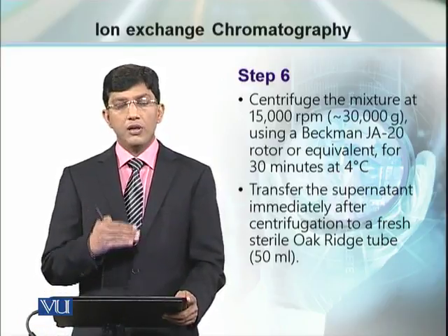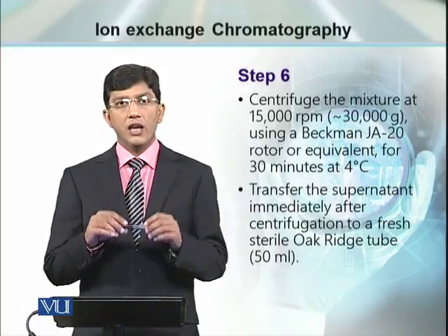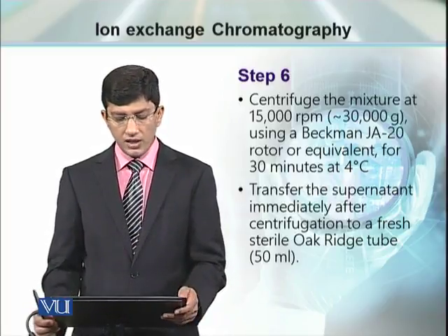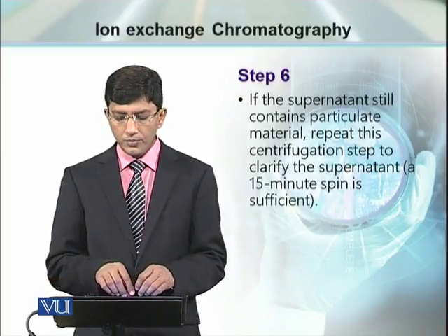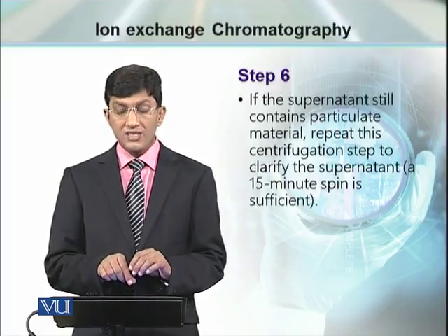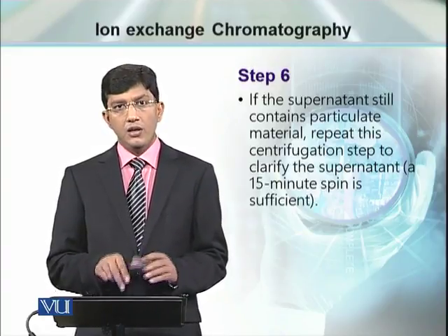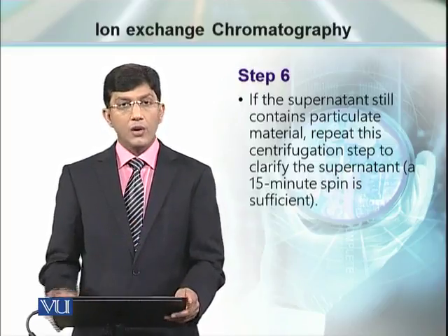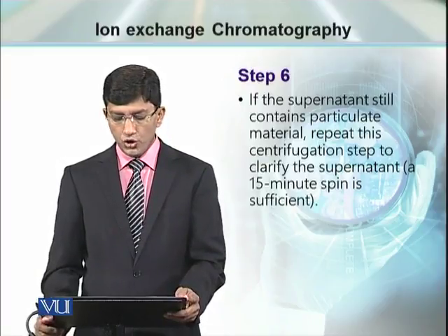And this is the step up to which we simply lysed the cells and got the plasmid DNA in the cell supernatant. Now, if we see visibly that the supernatant still contains some particulate matter, the centrifugation step can be repeated. A centrifugation time of 10 to 15 minutes is sufficient to settle all the particulate matter in this tube.